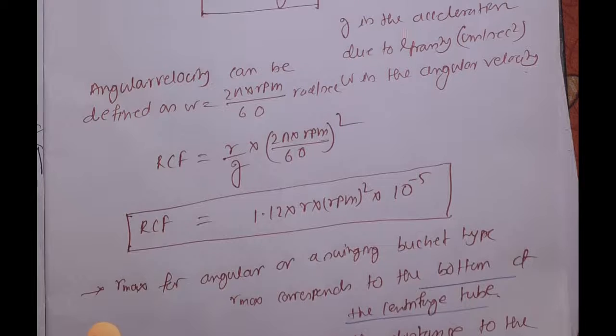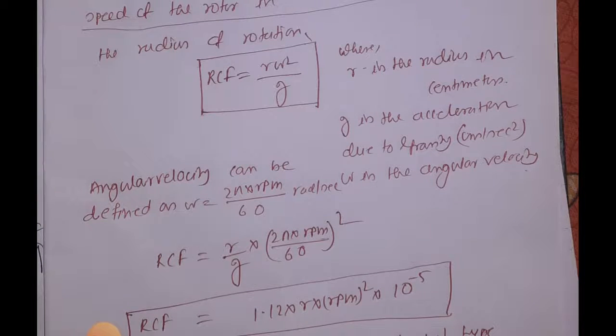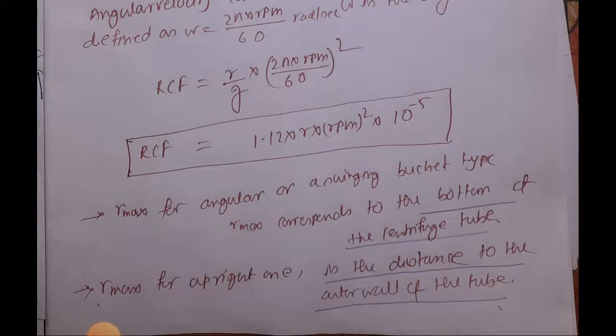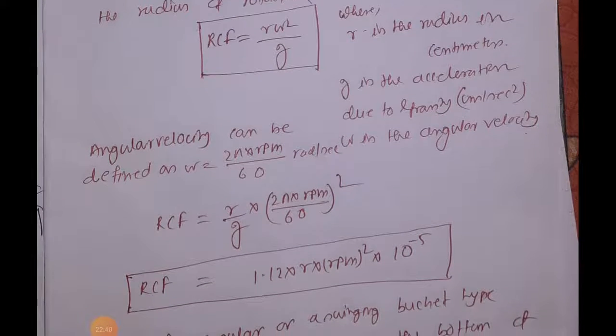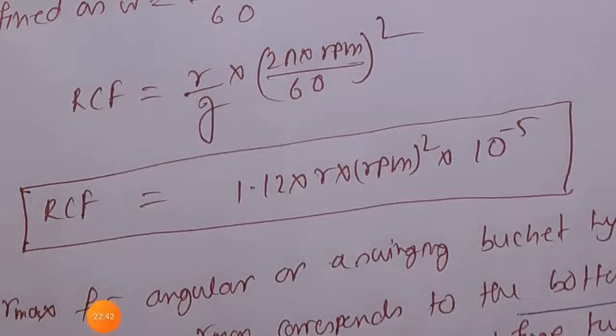Now, I mentioned during the fixed angle rotor explanation that there is a term Rmax. What is the requirement of this Rmax? Just try to focus on that formula.